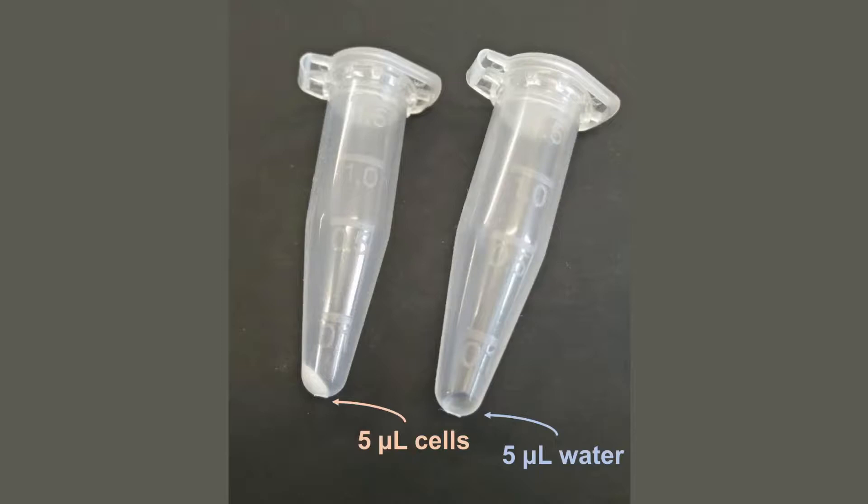Determining how much material generates a 5 microlitre pellet is visual. Pellet various quantities of cells and compare to 5 microlitres of water in an Eppendorf to determine what volume of cells is roughly equal to volume of water.